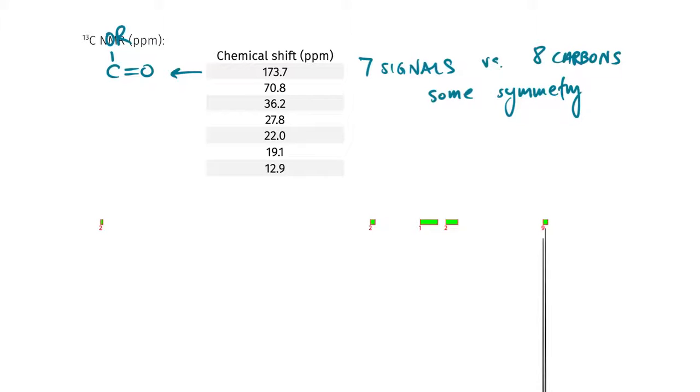When I was at number 2, it was either a ketone or aldehyde, because the HNMR said it was an aldehyde, but then the carbon said it was a ketone. Well, ketones and aldehydes will both be about 200, okay? So again, there is overlap, and your job is to pick out useful information from noise, okay?